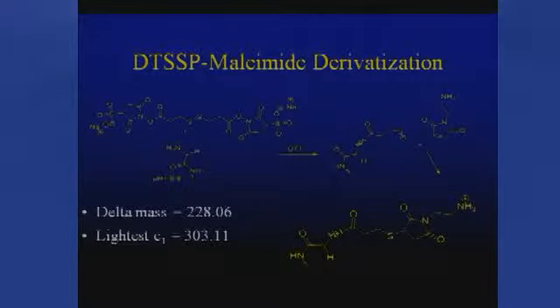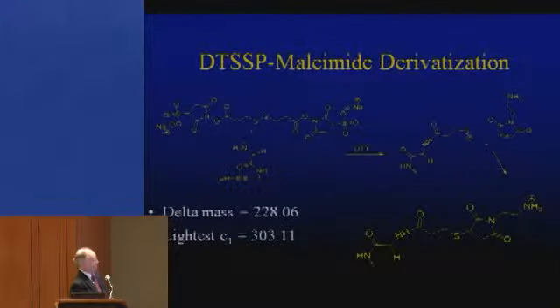If you let that amino group attack that carbon-oxygen double bond and displace the hydroxysuccinimide sulfate, then you produce this tag species, and if you let it then react with aminoethyl maleimide, then the sulfur adds across the double bond, and now you've tagged the amino terminus of the protein such that you've increased the mass of whatever residue is there by 228. And if it's glycine, it would be 303.